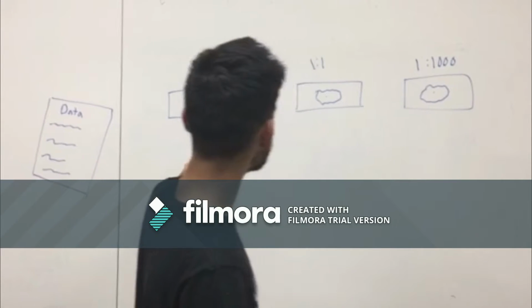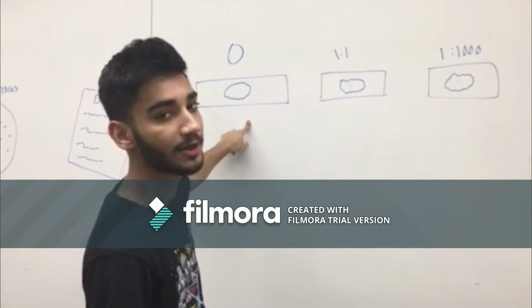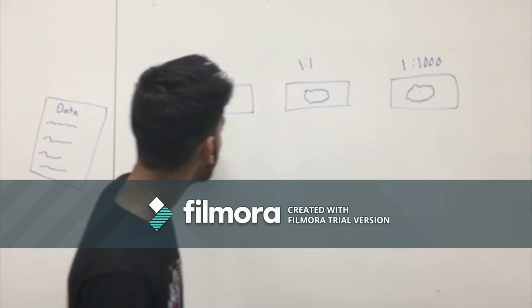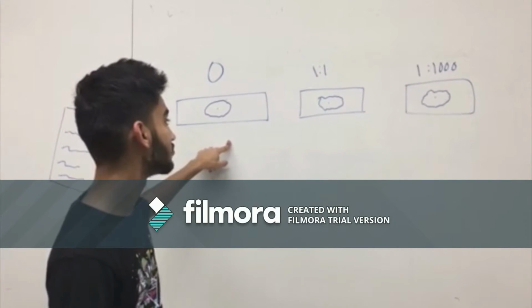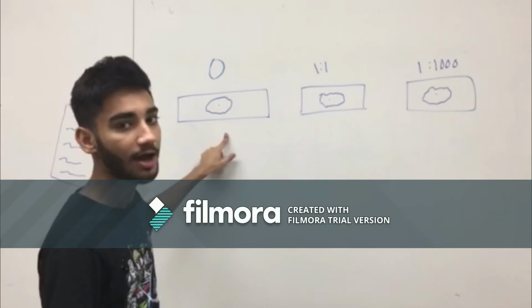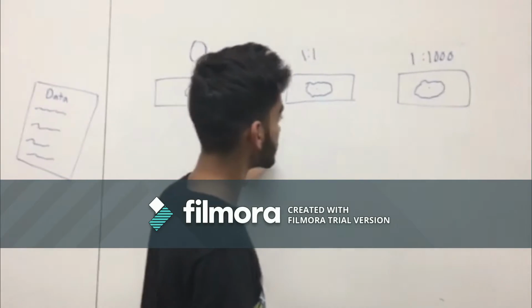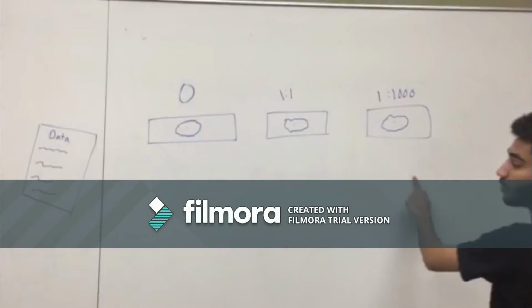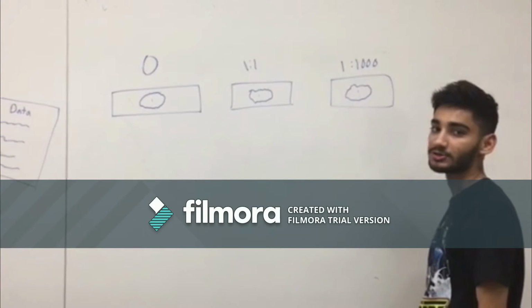Each shrimp is placed on a glass slide where it's mixed with trypan blue, as well as PBS. On your dissecting scope, you're measuring the cytotoxicity, where you're taking into account how many blue cells actually show up. Once this is all said and complete, each well of brine shrimp is then placed away for observations.